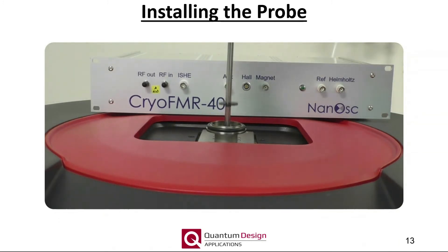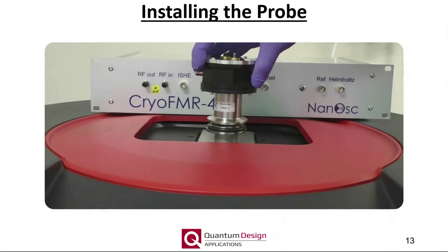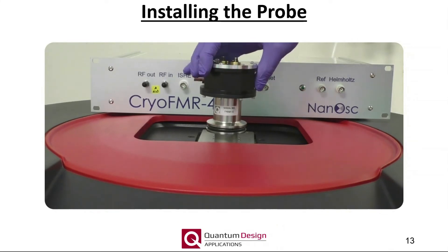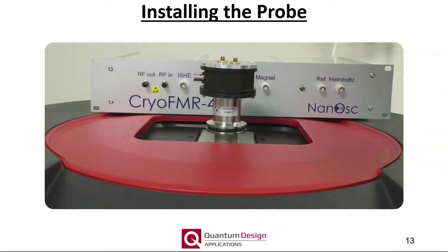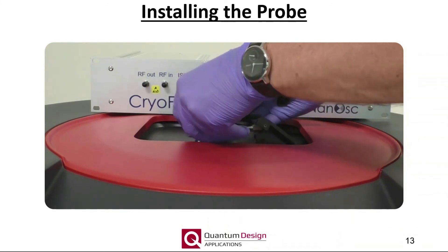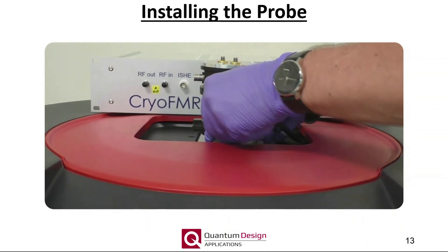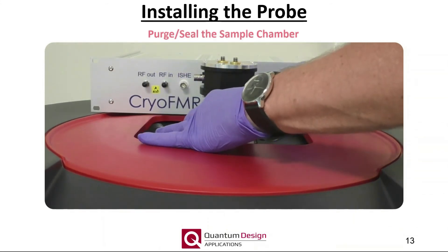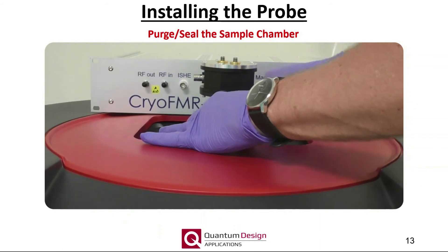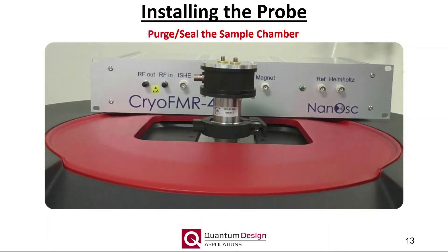As with a standard measurement puck, rotate the probe until the key engages, and press down to fully engage the sample chamber wiring. Once in place, clamp the probe. Once installed, it is best to immediately purge and seal the sample chamber. Keep an eye on the sample chamber pressure to ensure that there are no leaks.